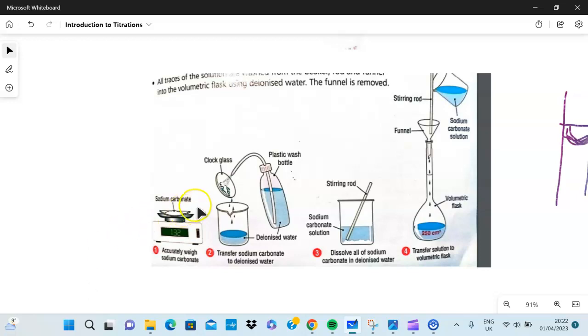First of all, using the example of sodium carbonate, you have to accurately weigh it with a balance. You find the mass of sodium carbonate. This structure here is called a clock glass. Some schools use plastic weigh boats. You put that into a clean beaker and then you use a plastic wash bottle with deionized water. Something very important to say is deionized water.